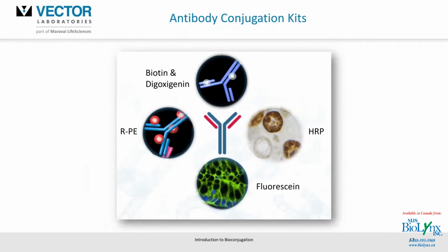So here's the selection of antibody conjugation kits, and the reason why I'm focusing on the kits, just to reiterate, is that this is an introduction to bioconjugation, and I think a very easy way to become familiar with the techniques and requirements would be to go with complete kits, something that includes all the necessary components and reagents to perform the bioconjugation reliably, to give you confidence then to go forward and perhaps use separate linkers later on or explore other opportunities.